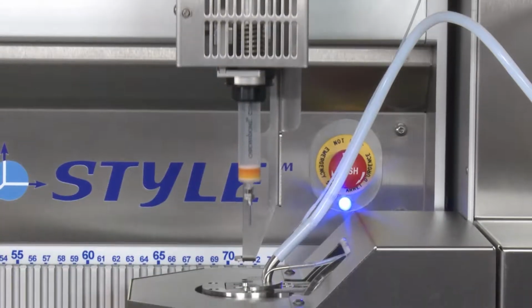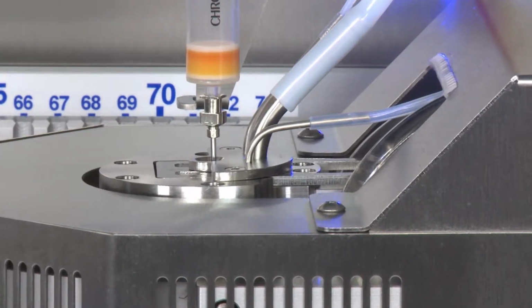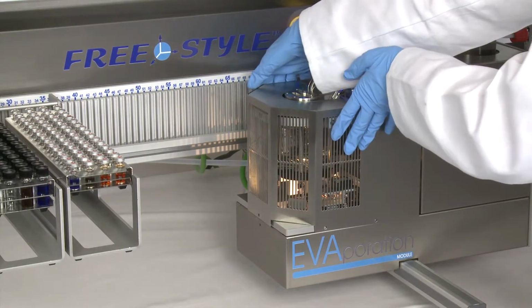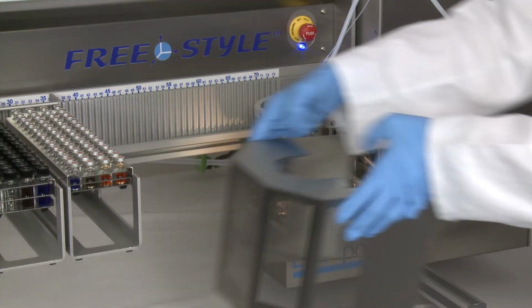Or it can be used for the concentration of an eluate from an SPE column, or for the online concentration of a GPC fraction. In the following, we will show you several details that are unique to the system and are incredibly advantageous for you as the user.